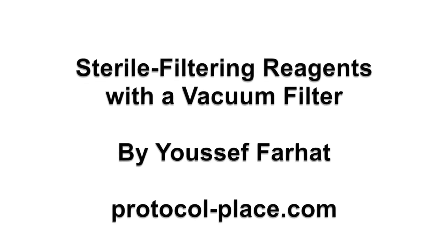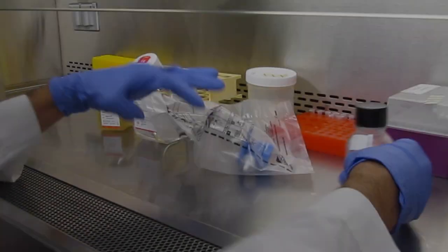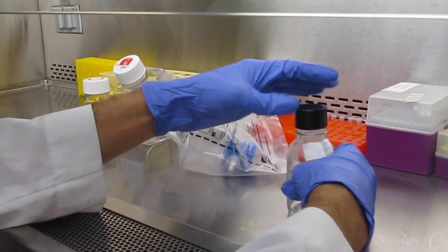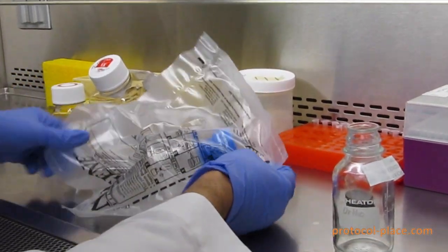In this short video we're going to demonstrate how to sterile filter reagents with a vacuum filter. This whole procedure is going to be carried out in the sterile environment of a culture hood.